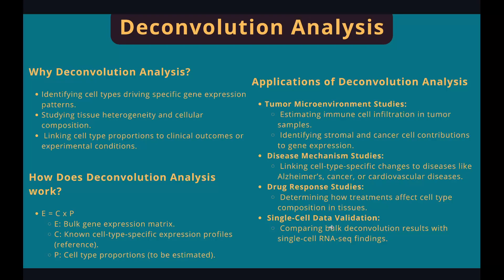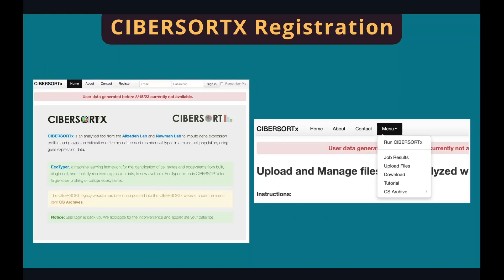In this tutorial, I'm going to show you how to estimate immune cell infiltration in tumor samples, as well as to estimate cell type proportions using single cell reference signatures. Now let's go to the web page to create a free account, which provides you with one gigabyte of storage, which is more than enough for regular use. Once you log in, go to the menu button at the top of the page to show all the options. If you're lost, just go to the menu button and click on the buttons to go to the pages you want.